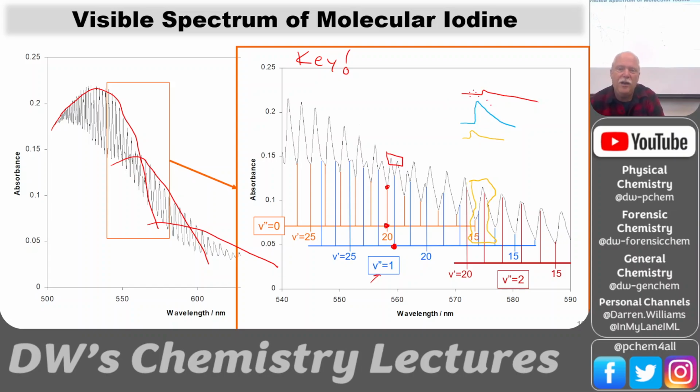And so when we add those three together, we get this little shape right here. We have a tiny little orange peak right here. Then we have a big blue peak, and then on top of that we have this tiniest little red peak. And that's what's happening right there when we have these three overlapping. So we have three different intensities, blue being the strongest peak in that region. And so all we're looking for is a change in slope.